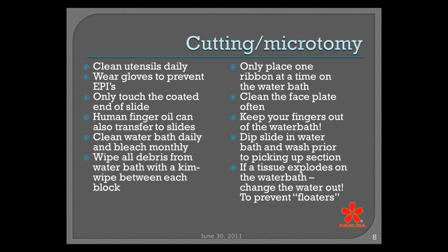Another thing to keep in mind is to clean the faceplate of your microtome. I just go down to my local hardware store and purchase those disposable cheapy paintbrushes and have one at each microtome, and periodically I'll pick up that bigger paintbrush and brush all of the debris off of my faceplate so I'm not picking it up as my ribbon is coming off of my knife.